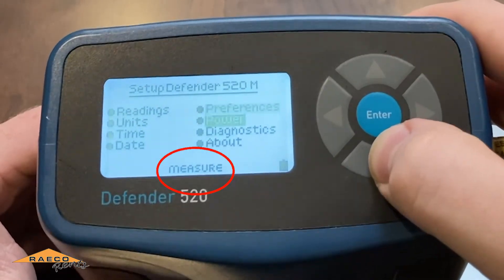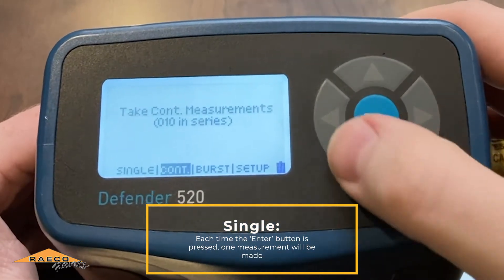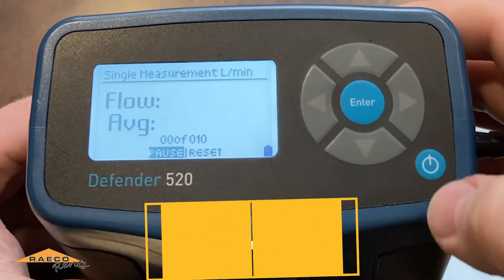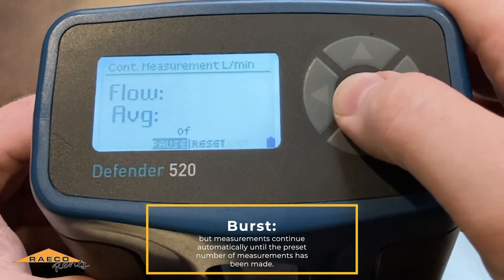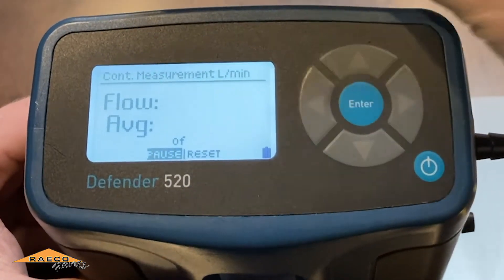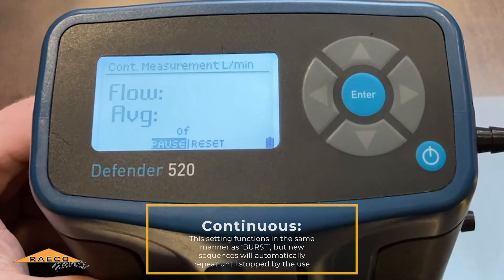We'll go to the measure menu, and this is where you'll see those options: single, continuous, and burst. I like continuous — it makes things pretty simple. Single is just going to take a measurement every time you hit enter, so it won't do anything until you hit enter. With continuous, it just keeps going, though it won't actually do anything until we start pulling air with the pump. I like to do the continuous, so we'll go with that.